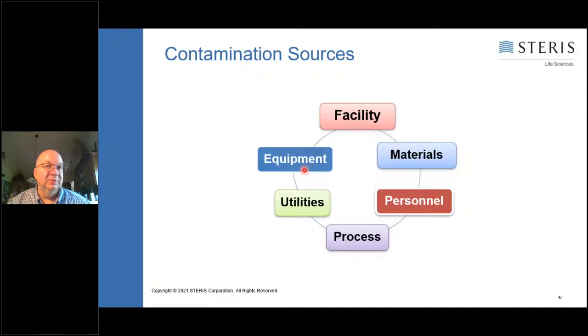A good example was a couple weeks ago, I'm teaching a course at PDA, and I noticed in the room that I'm in, they have a number of shelves in the clean room, and a shelf is actually blocking the return vent in the room for the HEPA filtered air. So anytime you block the return vents, that HEPA filtered air, when it hits the surface and comes down and goes toward the vent, will not actually get into the vent. So you're blocking airflow in the room, which can stir up contamination. And you can even get what we call these little spin-ups in the room called clean room eddies. So you're not then getting truly HEPA filtered airflow in the room.